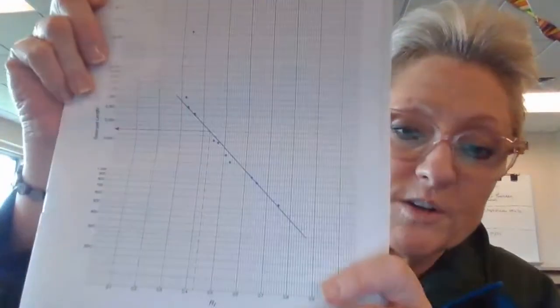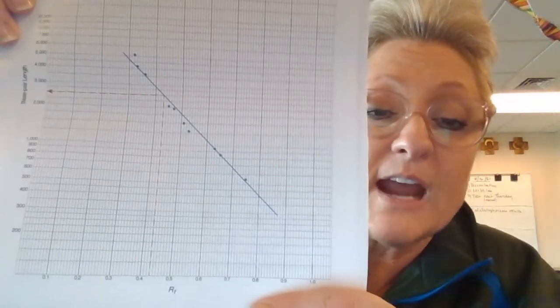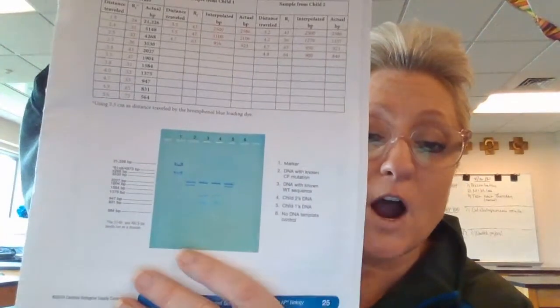I'm going to show you that picture one more time. The red part is where you're interpolating, and the blue line and the dots are the known values that we used. So that's how you interpret the data that you got from the gel. You're just taking measurements and looking at how far the band traveled from the original place to get those numbers.